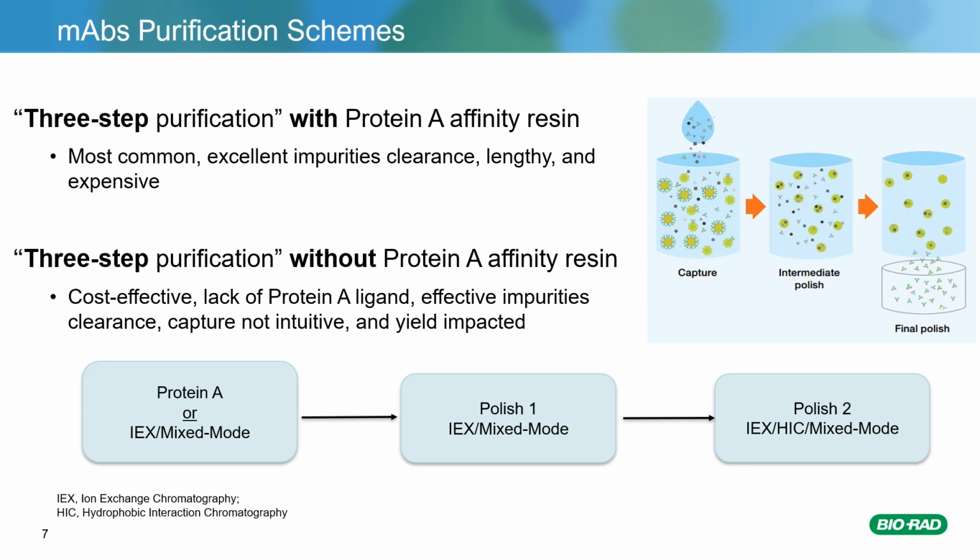However, the development of a capture step might not be intuitive. Also, process yield can be negatively impacted. It's worth noting that different mixed mode resins can be placed in actually any stage of the purification process. Please note that these workflows show only chromatography steps, and for simplicity, other downstream processing steps like virus filtration are not included.